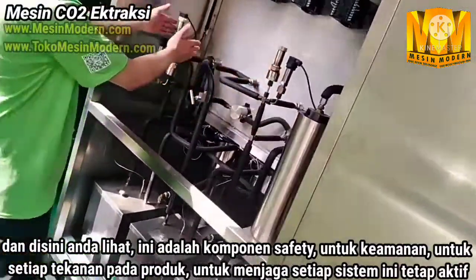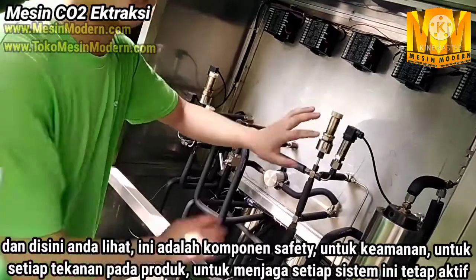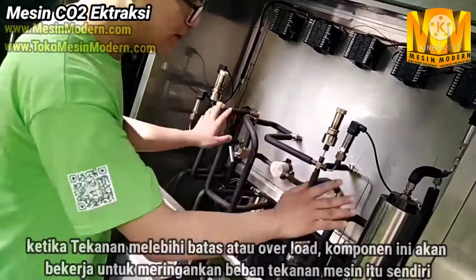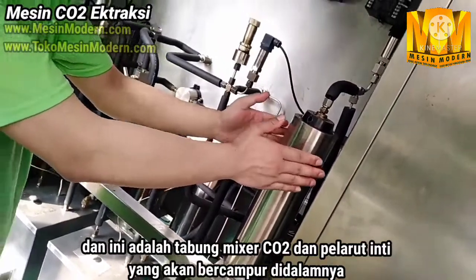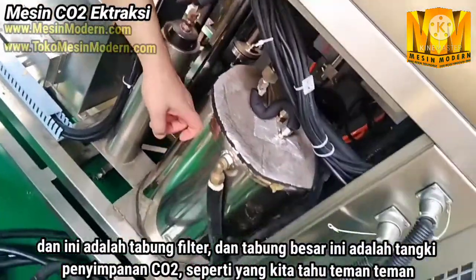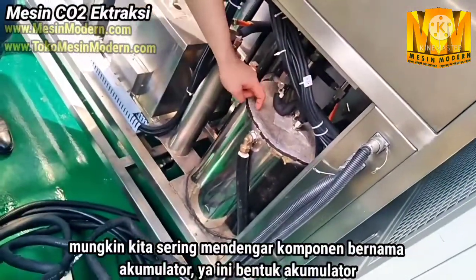These are safety valves for each vessel, which will also keep the system safe. If the pressure exceeds the upper limit, they will work to relieve the pressure. And here is a mixer — CO2 and the co-solvent will mix inside. And this is a filter. And this is a CO2 storage tank — in the US, they are likely to call it an accumulator.